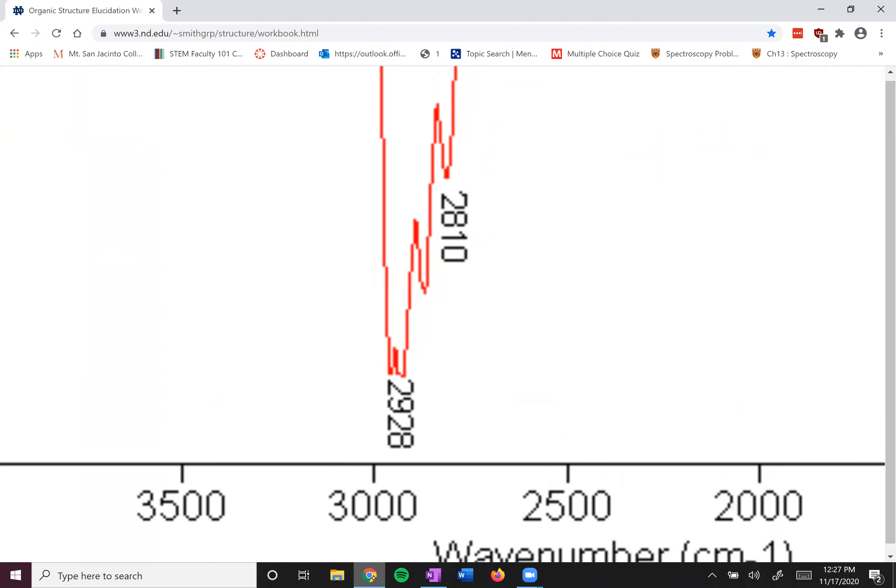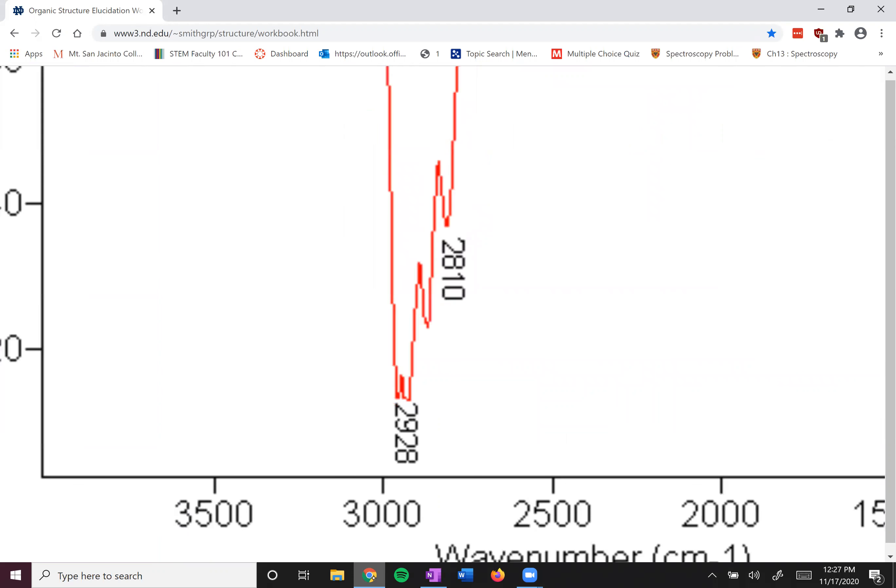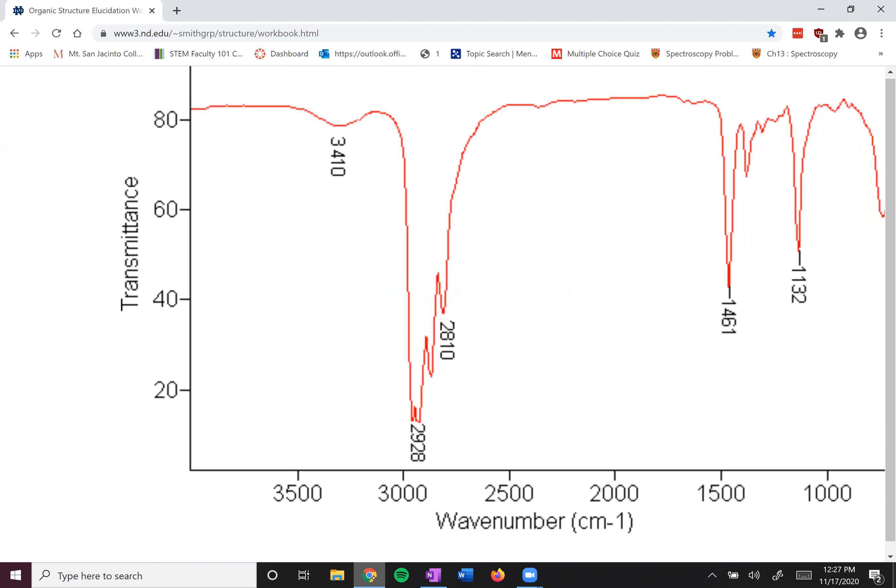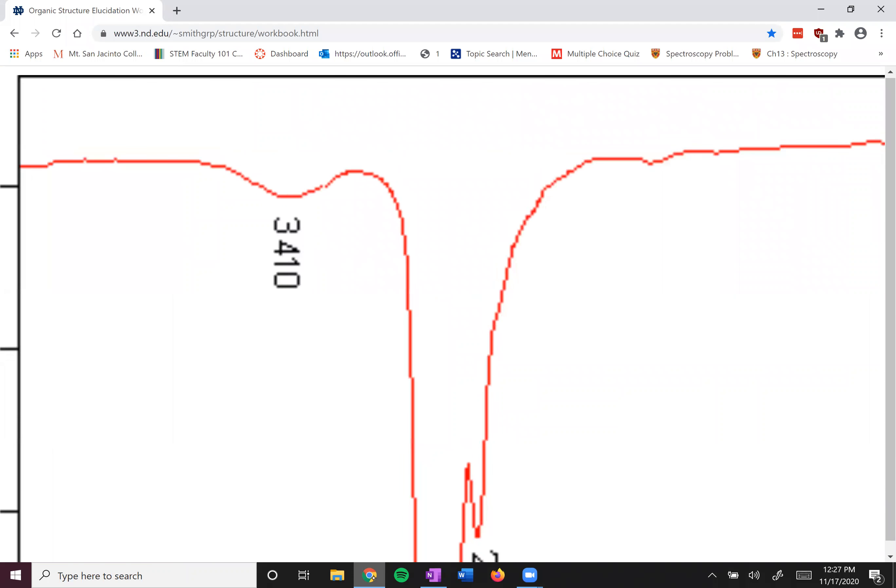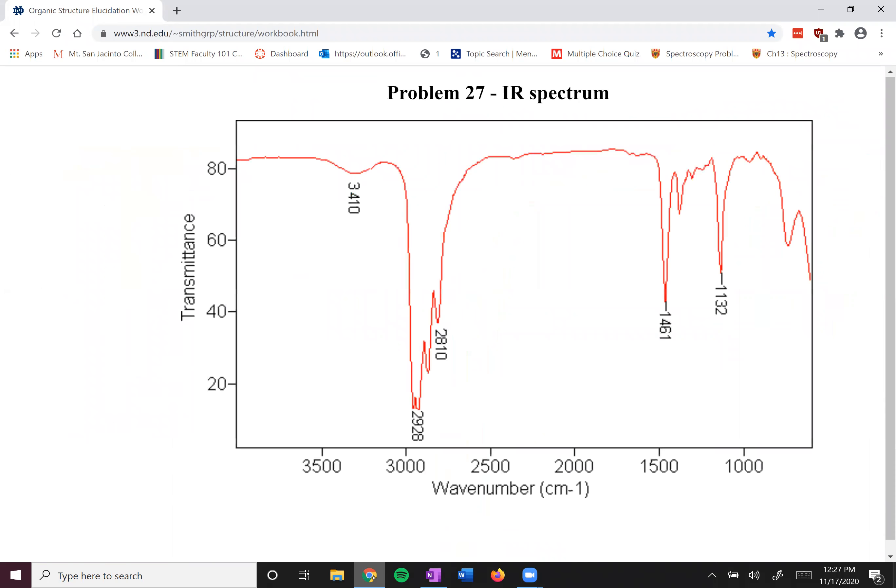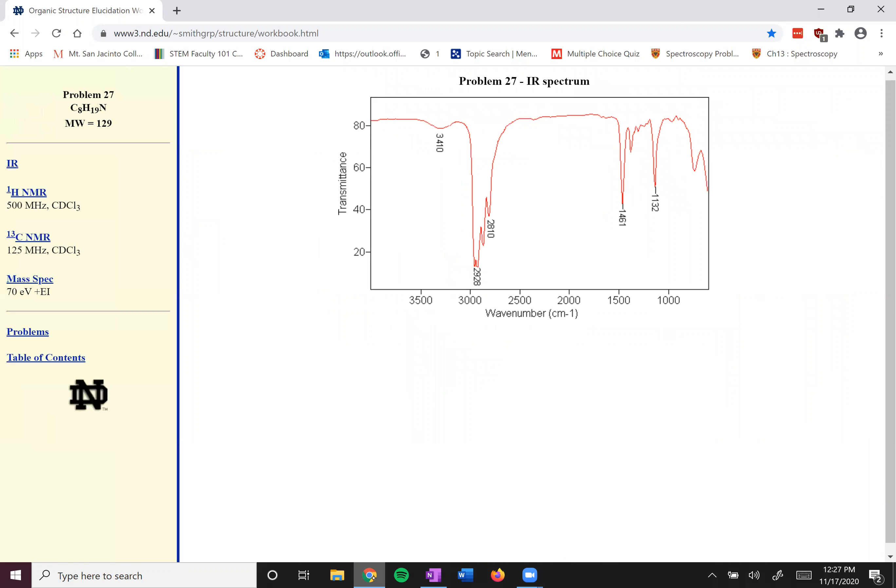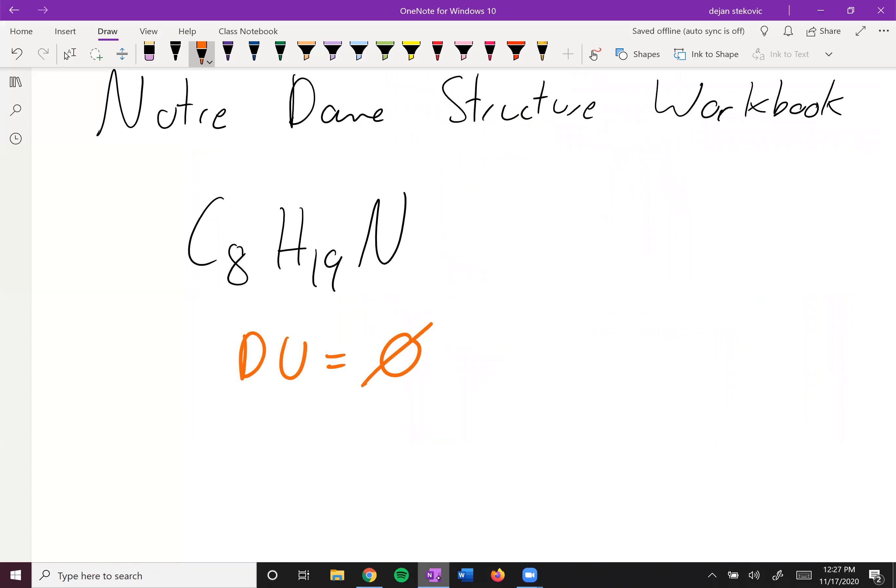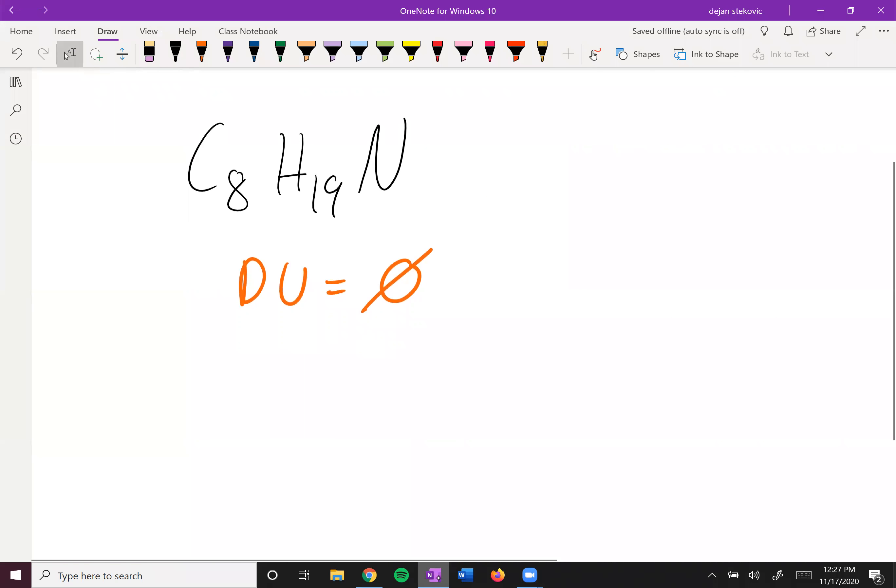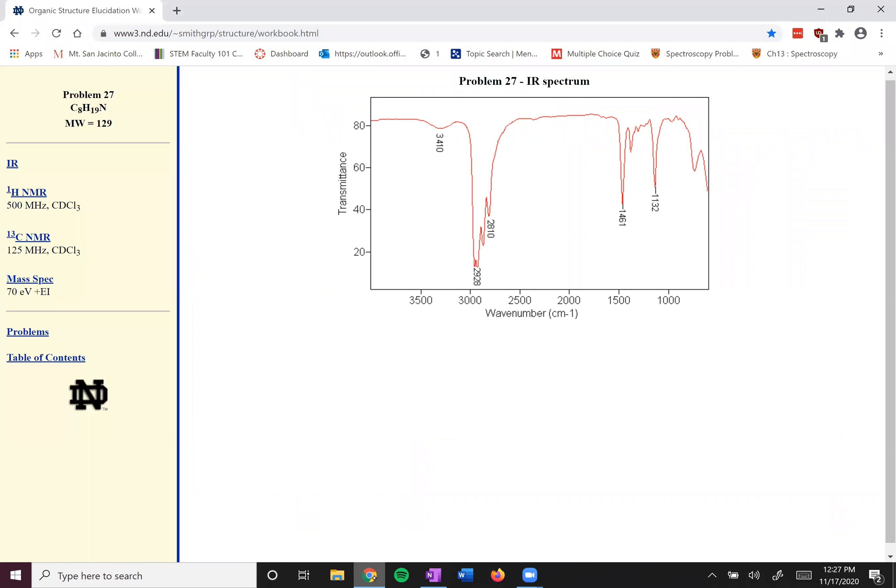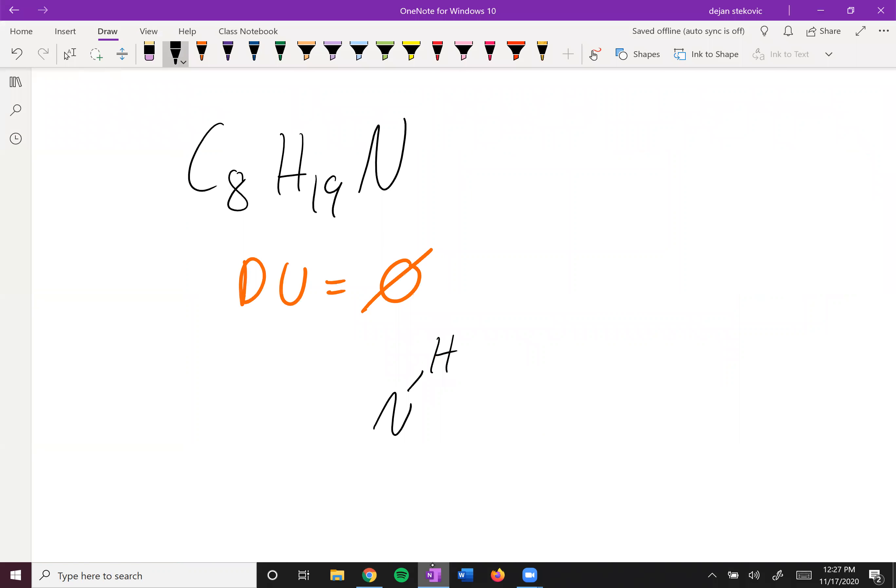We have our CH peaks, something that we would expect. Not really that helpful. And then he very nicely labels this 3410 peak, this broad 3410 peak. We don't have an oxygen, so it can't be an alcohol. So it has to be an amine. It has to be an NH bond. And if you look at it, it looks like there's only one hump. And so that probably points to a secondary amine, a nitrogen with an H and then two R groups attached to it.